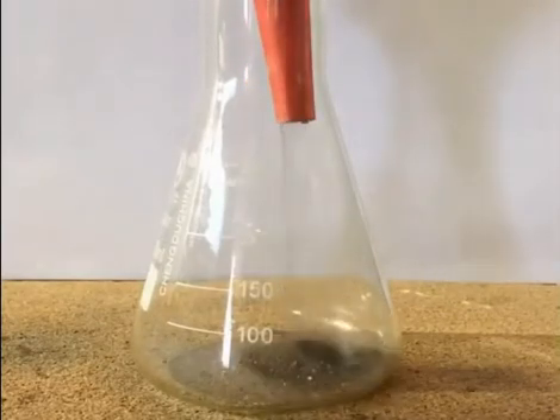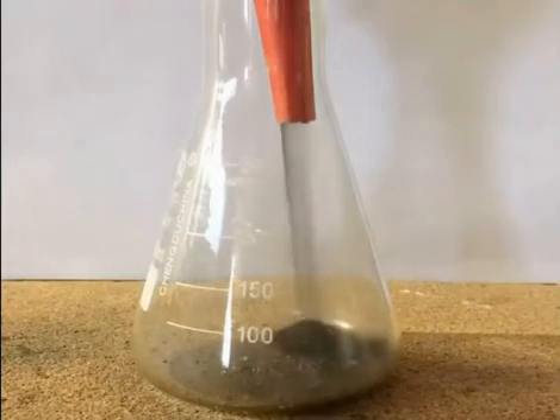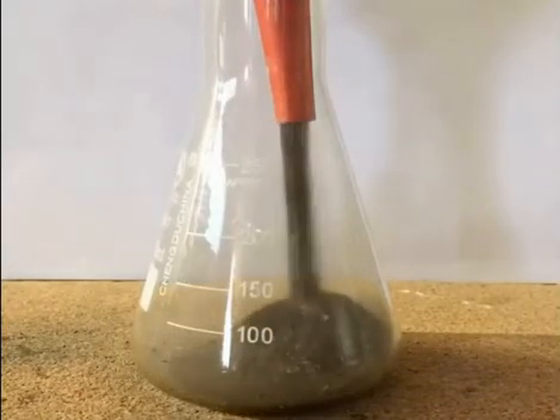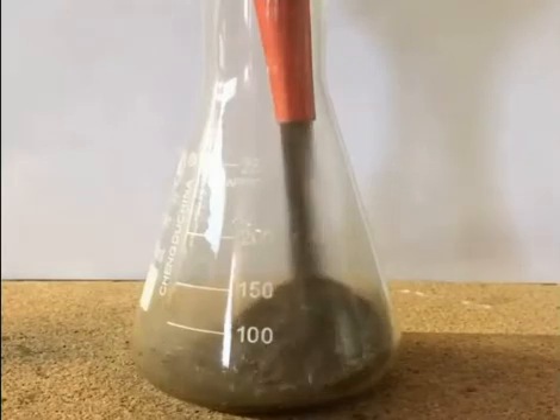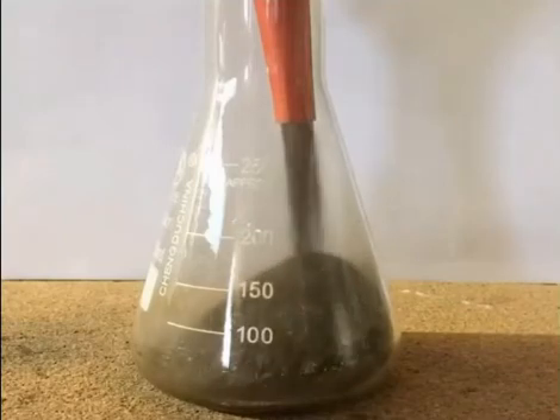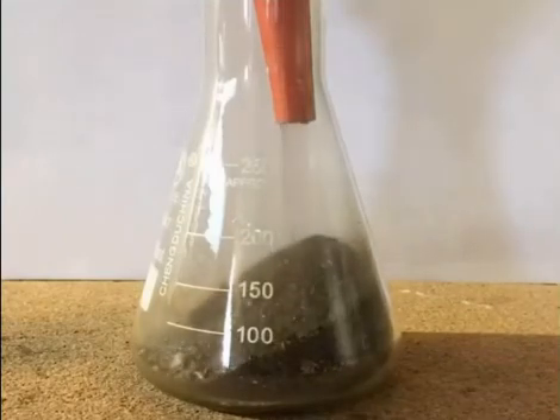To start, we put the roasted and ground bones in an Erlenmeyer flask. The bone meal weighs 83 grams. The roasting step is necessary to remove any organic material that could interfere with the reactions.